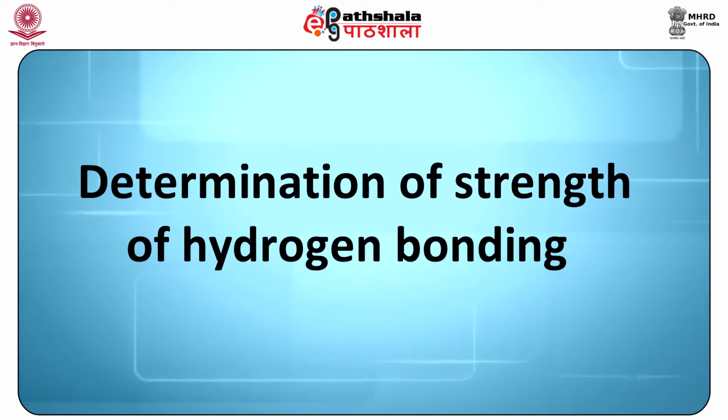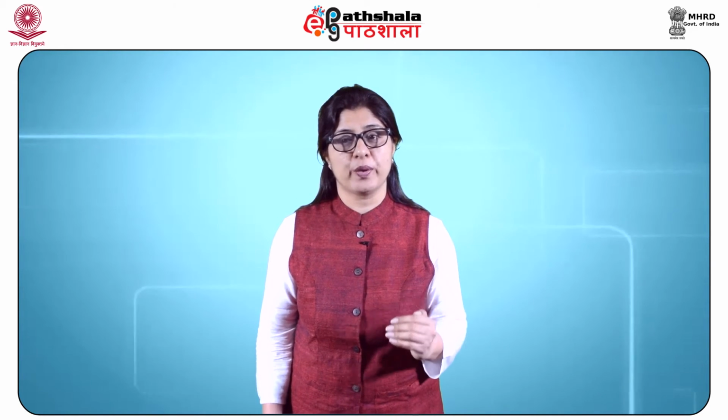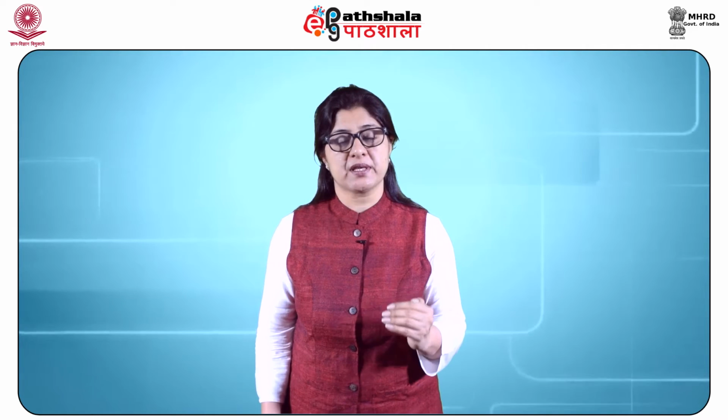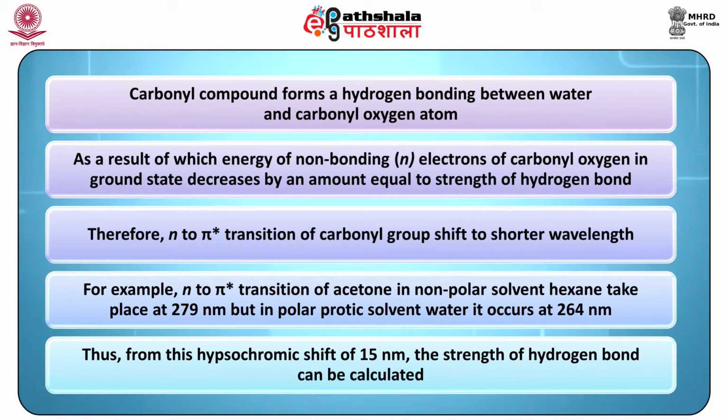Determination of strength of hydrogen bonding. The strength of the hydrogen bonding formed by a compound with polar protic solvents such as water or alcohol can be studied with the help of UV visible spectroscopy by comparing the lambda max in a protic solvent and in a non-protic solvent. For example, the carbonyl compound forms a hydrogen bond between water and the carbonyl oxygen atom, as a result of which the energy of the non-bonding electrons n of the carbonyl oxygen in the ground state decreases by an amount equal to the strength of the hydrogen bond.